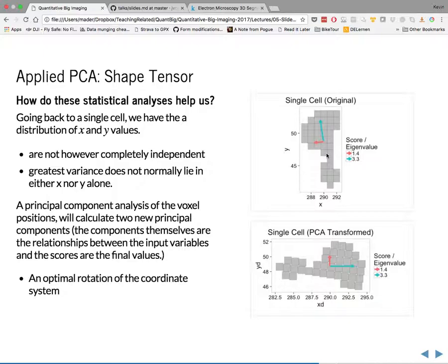And then we can apply morphological erosion before. Right. So if we applied an erosion before, what would that do? It's 2 objects. Yeah. So it would delete that pixel in between, and then you would have two separate things. Oh, okay. Yeah, but it sort of depends. If you have very small cells, then doing an erosion in between might also erase little parts of your cells. Or maybe this is one cell that's in the process of dividing. From here, it's very difficult to say if you would want to keep that as one cell or two cells.